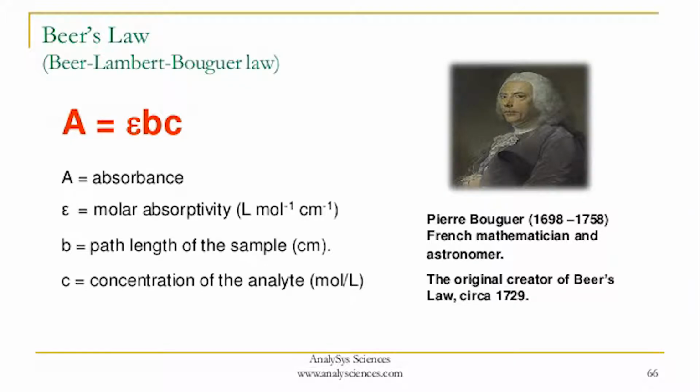The extinction coefficient is related to the amount of light absorbed for a particular sample per the amount of that sample. This value is unique for each substance, but once determined can be used for further calculations on a particular system.